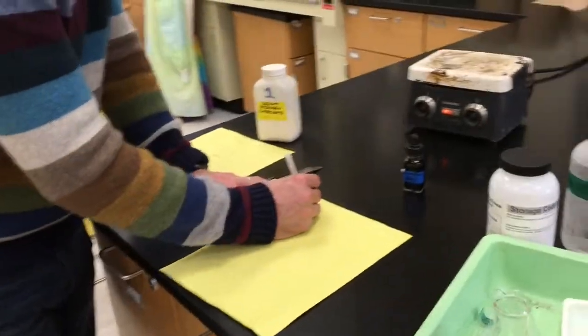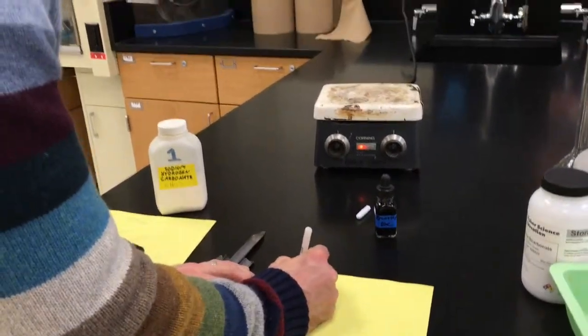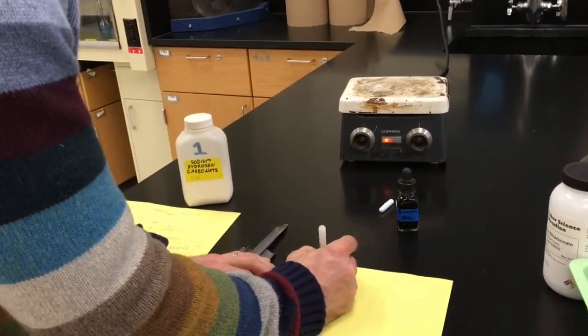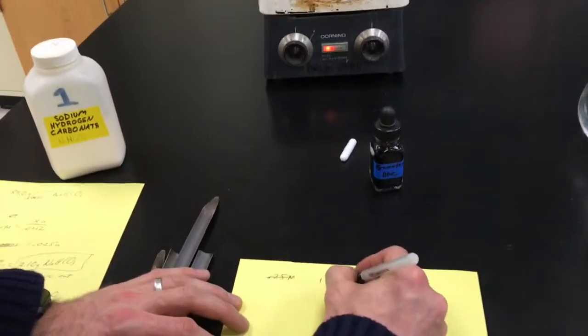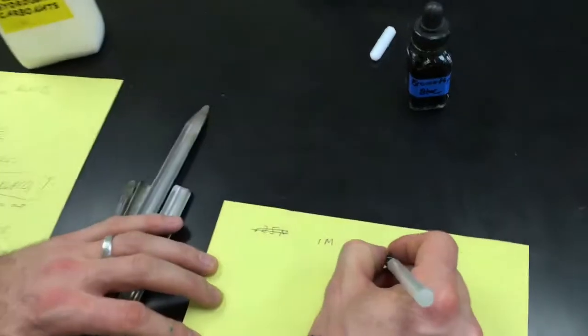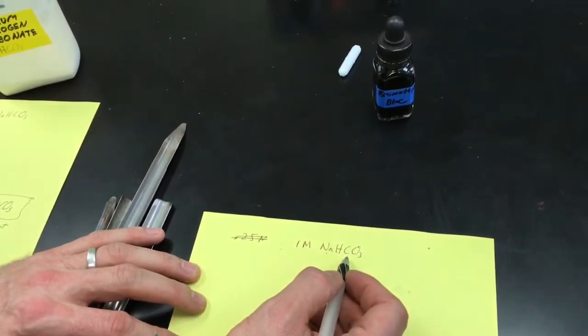So first thing you need to know, and I'm going to write this down here, is you guys are going to make a 1 molar NaHCO3, also known as sodium bicarbonate or baking soda.